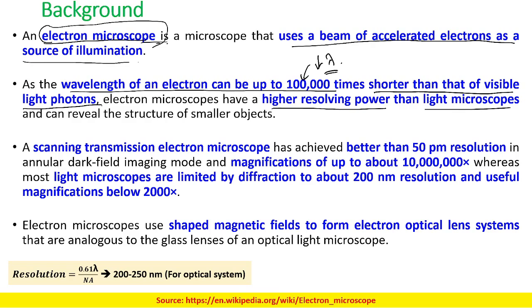A few moments back I told you the color information is displayed only in the region of 400 nanometer to 800 nanometer. So you work only in this region. In this region only, if the electromagnetic radiation has a frequency in this region, then you will get the color information. If you go outside this region, towards the UV region and the other electromagnetic radiations, or higher than the infrared light, you will not get any information.